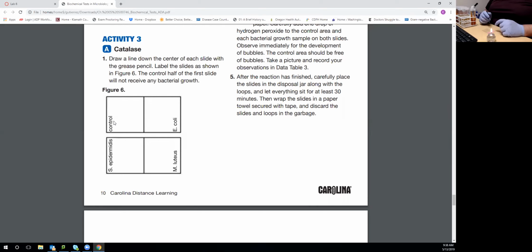And what am I going to do next? That's right, I'm going to label it so I don't forget what's what. E. coli. I keep on saying that because some of you have been complaining about mixing the wrong stuff together. So if that's the case, then you really need to label everything that you do so you don't make that mistake. Okay, so there it is, epidermidis, luteus, E. coli. My E. coli doesn't look so good. Let me do my E. coli again. There you go. All right, there's my E. coli.